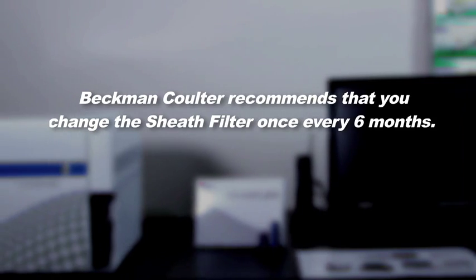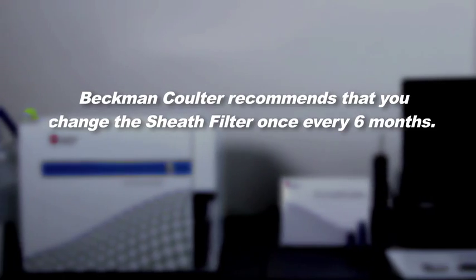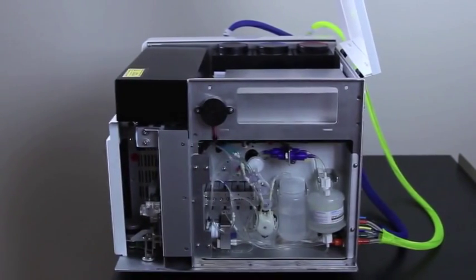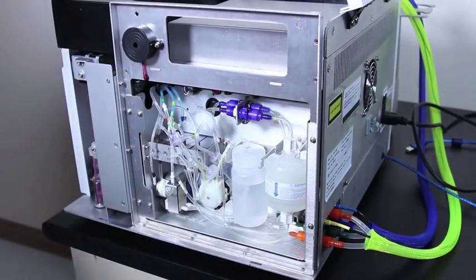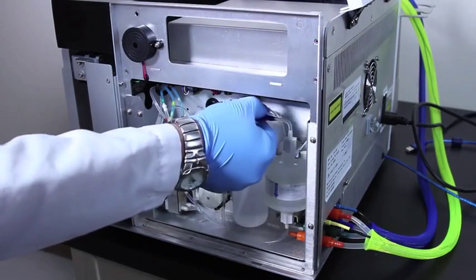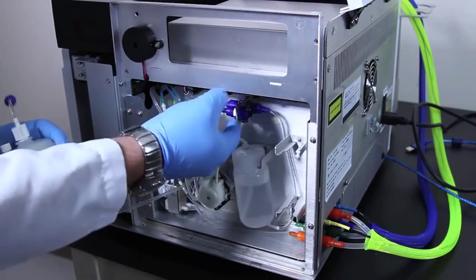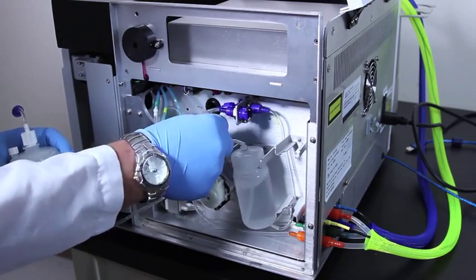Beckman-Coulter recommends that you change the sheath filter once every six months. In order to remove the sheath filter, simply disconnect the quick connector located at the top of the filter area. Gently pull out the filter and disconnect the other end of the quick connector.